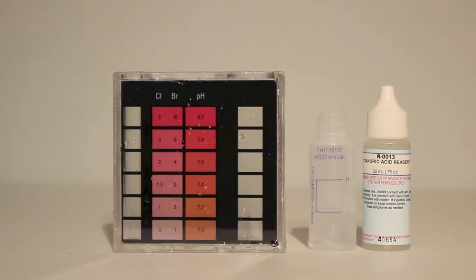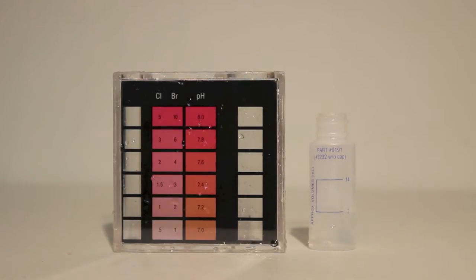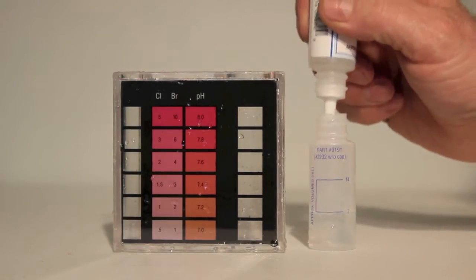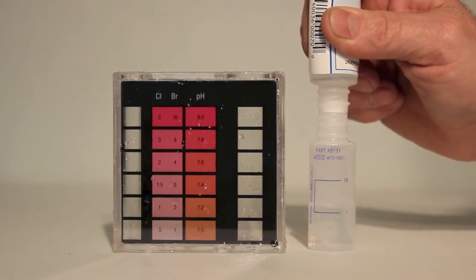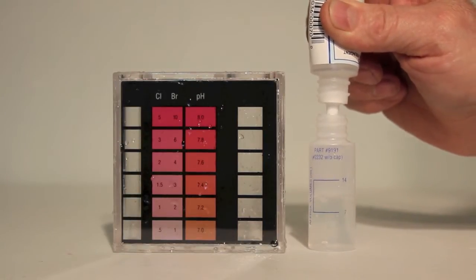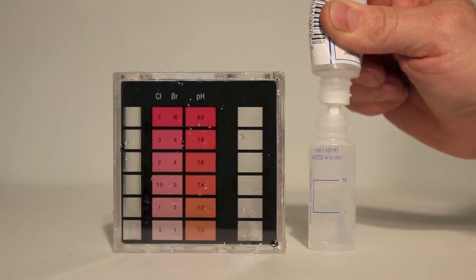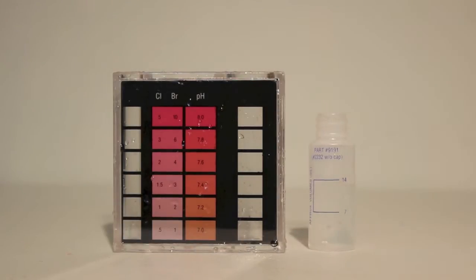Then we'll add that solution to the small cylinder on our comparator test block. And we will fill until we can no longer see the black dot in the bottom of that container from the top.